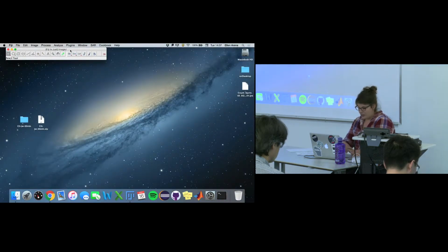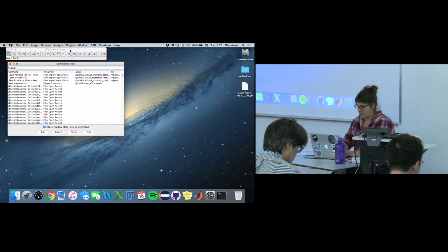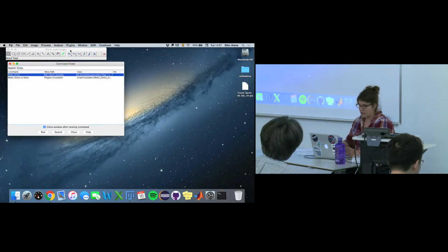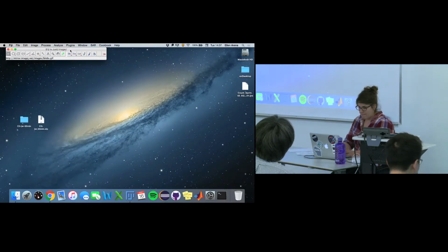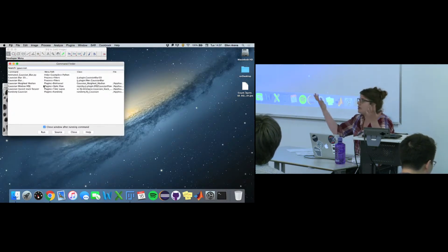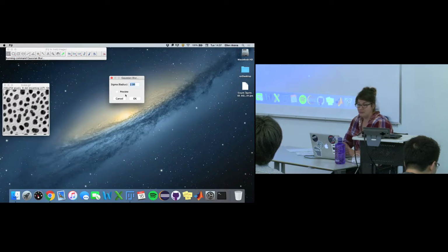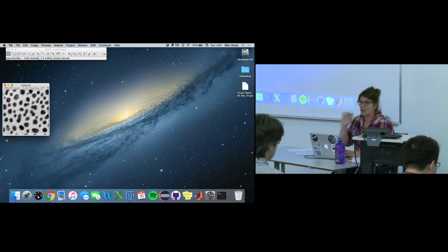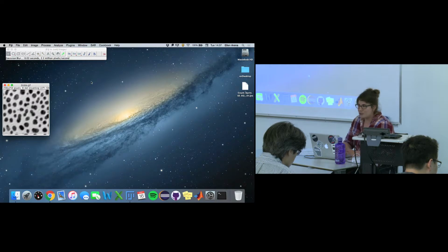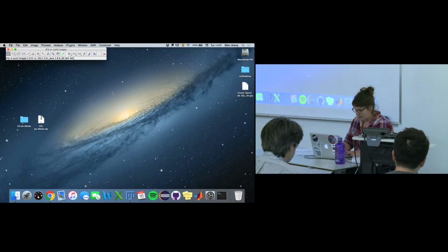And to activate the command finder, you either hit Control L or just L. And so now you can actually search for different commands. For example, I want to open a sample image called blobs. This is one particular sample image we will open later. And I want to do a Gaussian blur. So instead of having to think, where was that function hidden in the menu, I can just type it in directly in the command finder and boom, I can run my commands. So it really just helps streamline your workflow. You don't have to click and drag and search for stuff all the time. So command finder, shortcut is Control L or L, okay?